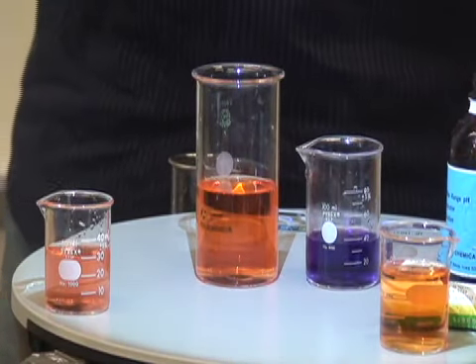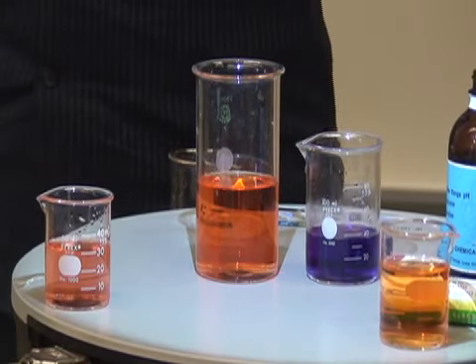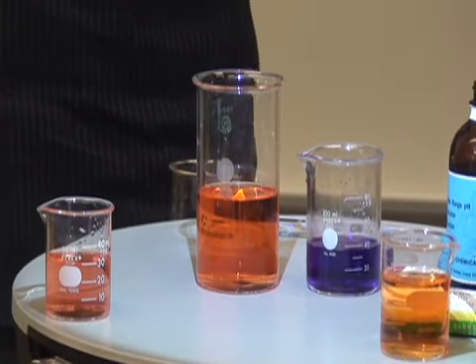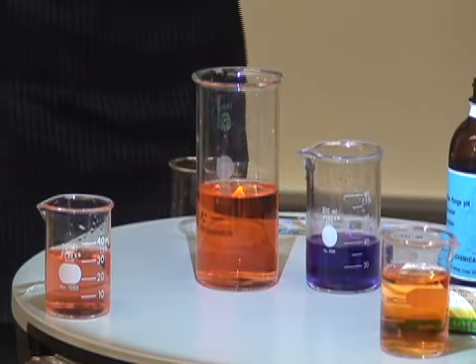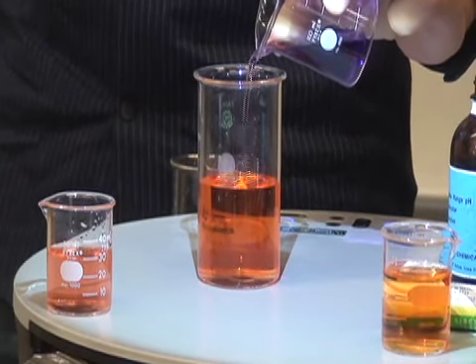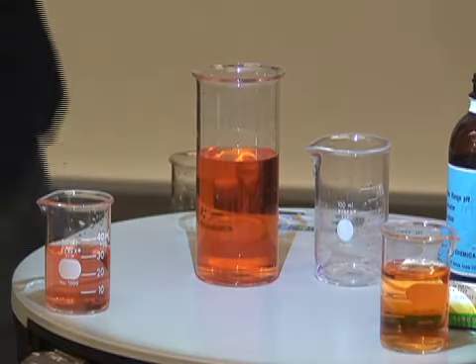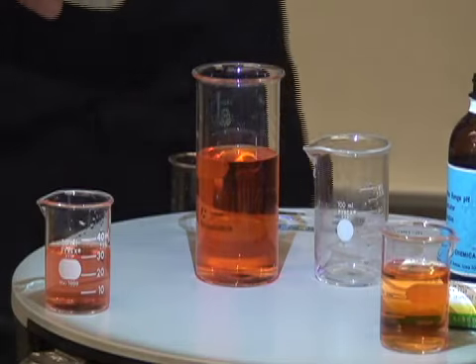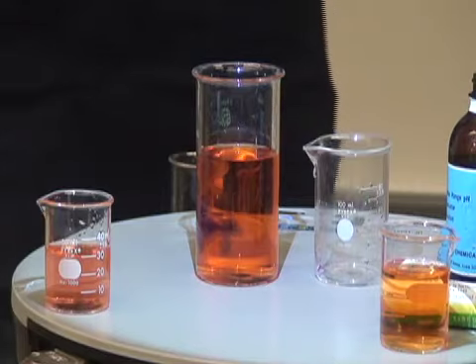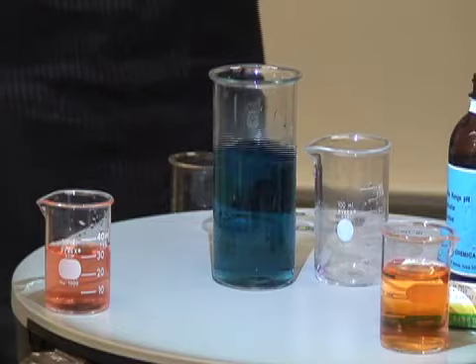Now, hydrochloric acid we knew was a strong acid. Is ammonia on our list of strong bases? No. Oh, no. No, it's not. So it must be a weak base. So, when we poured that last batch in, we really didn't see a change in pH, did we? We still didn't. Let's do it again. Well, let's just do it this way, shall we? Ooh, that changes it.